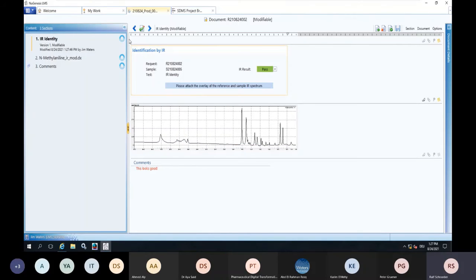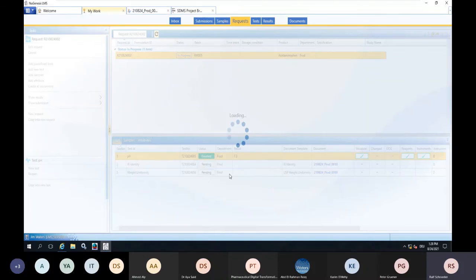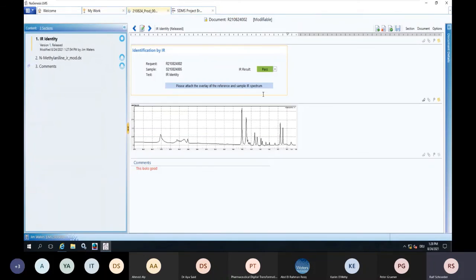and you can decide for this section now to release it, which will close the cycle here on the side and see that the individual building block is released. You can do this with all of them if you want to, and you can make it mandatory or optional. And then when you go here and refresh, you can expect that the path from this section is now moved to the overview of the entire analysis.